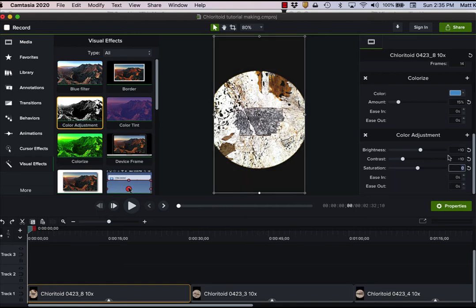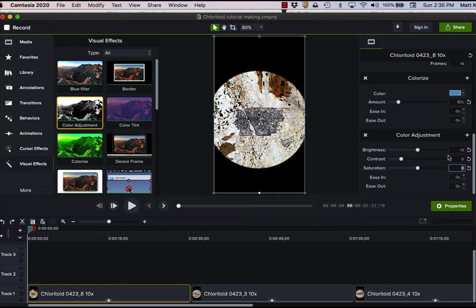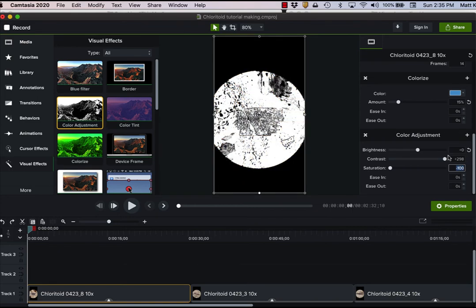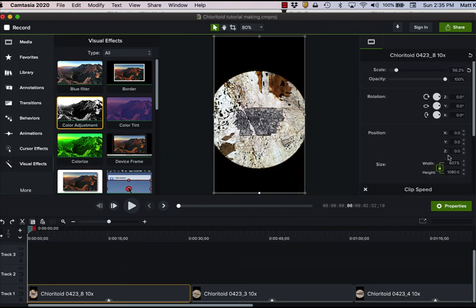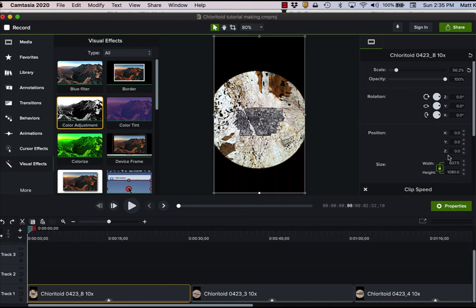In this case, I don't think it's really worth it. But there have been some instances where I wanted to sort of brighten things up a little bit because the camera automatically tried to tone things down. When quartz is, it tries to make quartz look gray.